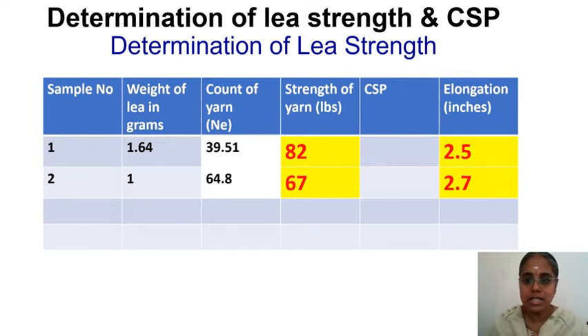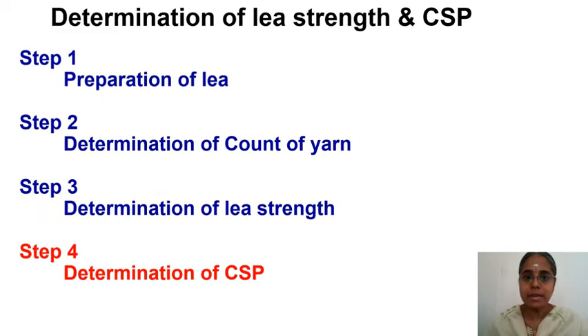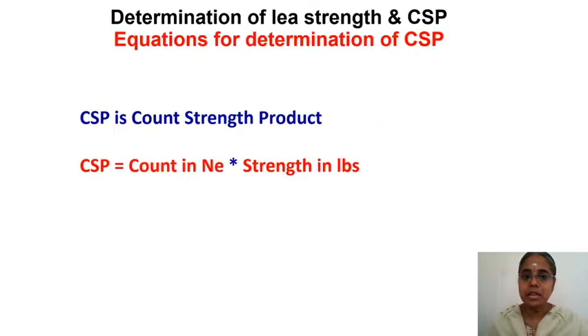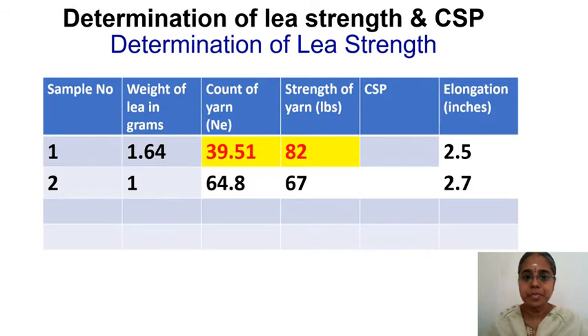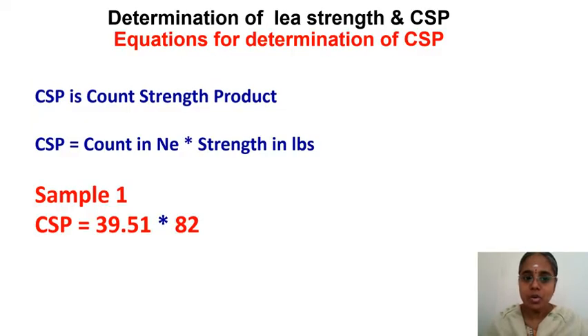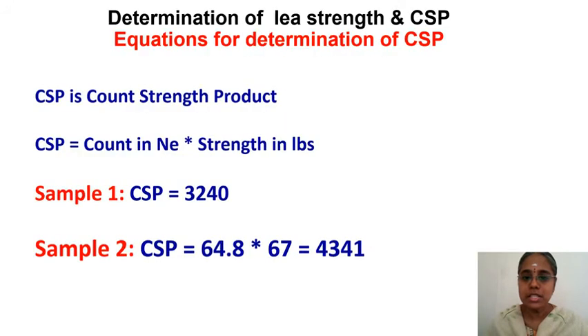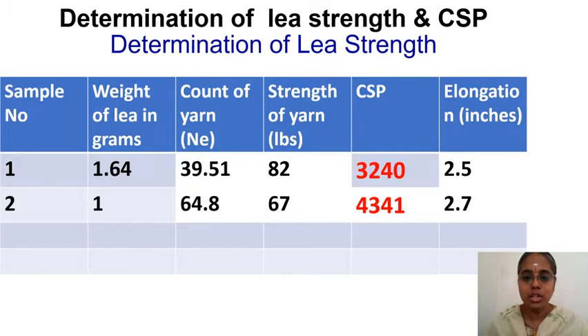Now place the second lea in the top jaw. Ensure the load scale and elongation scale are at zero. Place the second sample, put it in the bottom jaw, engage it, and switch on. The sample is cut — immediately stop it. The second lea strength reading is 67 lbs, and the elongation is 2.7 inches. We are now in the last step: determination of CSP. CSP = count × strength. Sample 1: 39.51 × 82 = 3240. Sample 2: 64.8 × 67 = 4341.